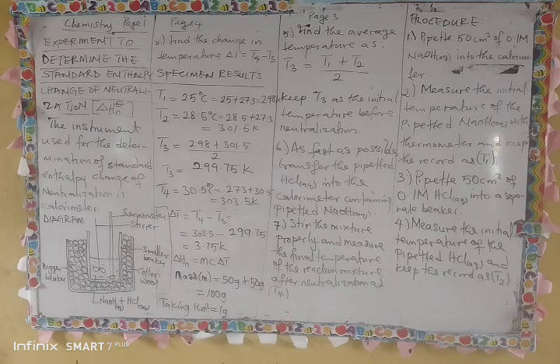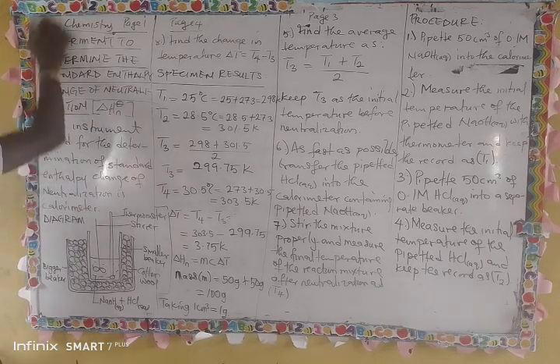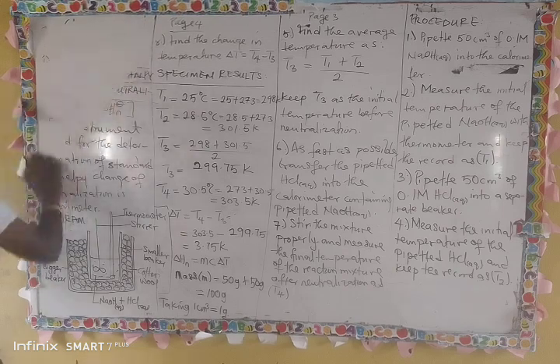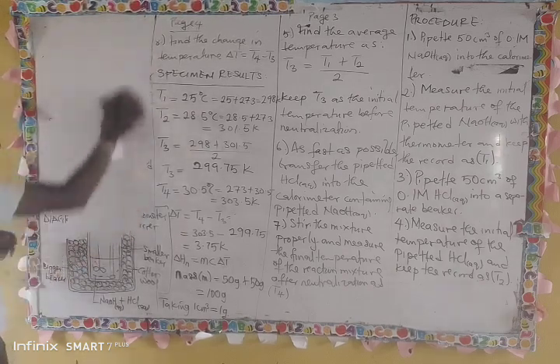This experiment we are doing now was the first practical WAEC exam in 1980 something. I saw it. But they no longer do it. I don't know why they don't do it again. Maybe because we are dealing with strong acids, so that it will not be harmful to the students doing it.